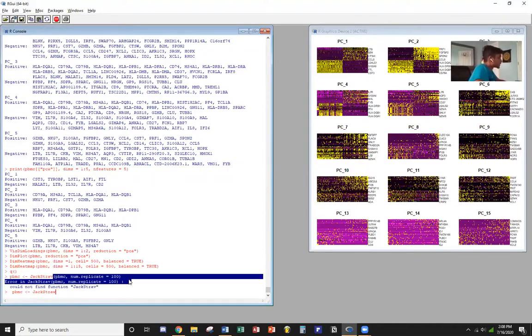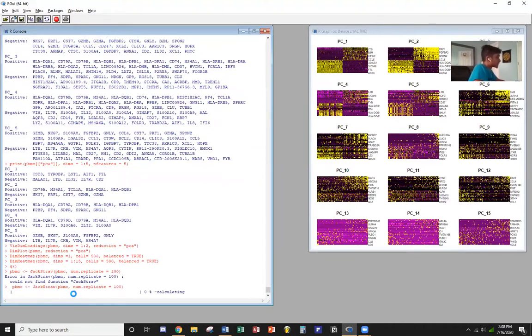So I noticed in my last part, part two, I was going a little bit slow, so I'm going to try to go a lot faster in this one. So I'm going to probably cut this part right here. So wait for it to load. This usually will take a while.